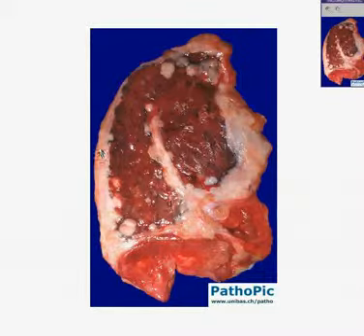Remember, these tumors may tremendously compress the lung or even invade the lung, like you see here. But most purists would not want to call them primary lung tumors. They would prefer to call them primary tumors of the epithelium or the mesothelium, which surrounds the lung, both viscerally as well as parietally. Here's a section through this little pleural area now, which is extremely thick because it's tumorous.